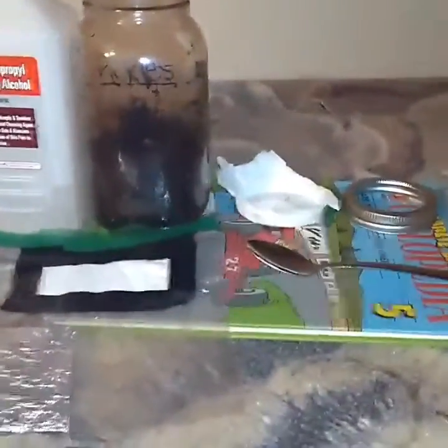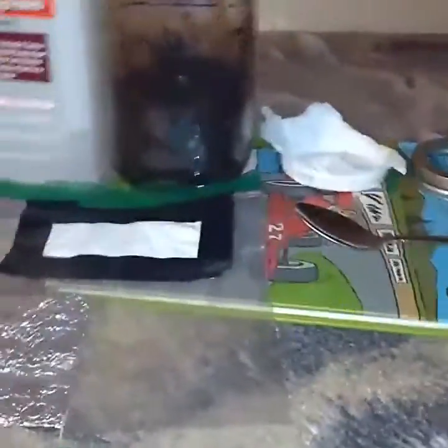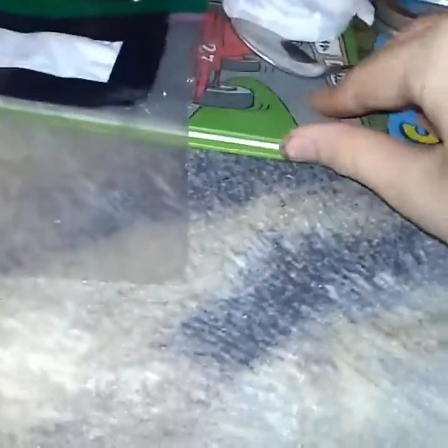Hey guys, Gourmet Mushies here. Today I'm going to be taking one of my spore prints from my portobello mushrooms and inoculating this jar right here. I've already cleaned this jar. I have the lid right here and the little filter for it. This right here is all cleaned off and non-contaminated. Hands are also clean.